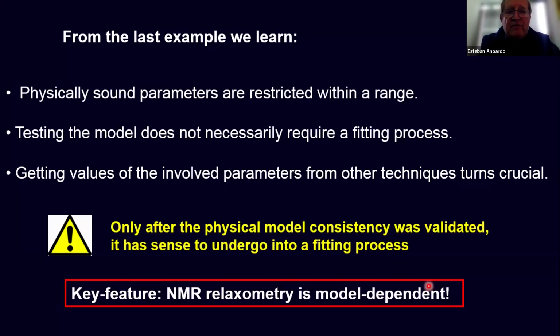Second point, testing the model does not necessarily require a fitting process. This is important. I remember when I was working with him many years ago, he insisted on this point quite a lot. He didn't trust fittings at all. Today, we are getting really ambitious, and we want to fit, and in fact, it is possible to fit, but we have to care about some details, okay?